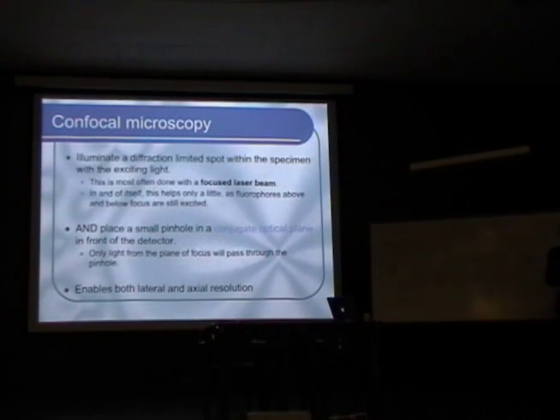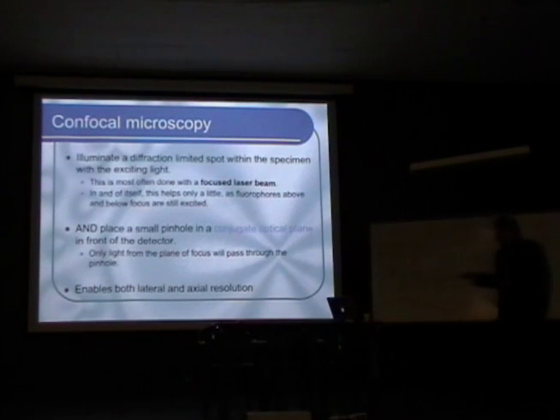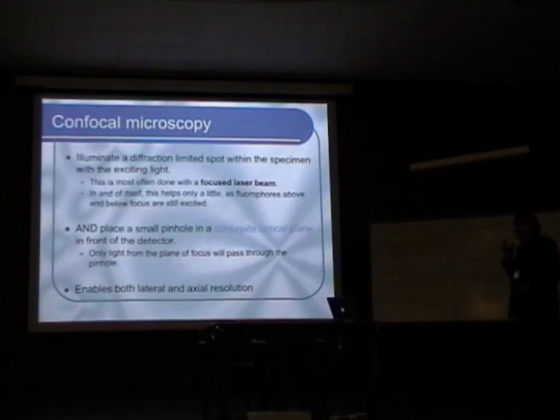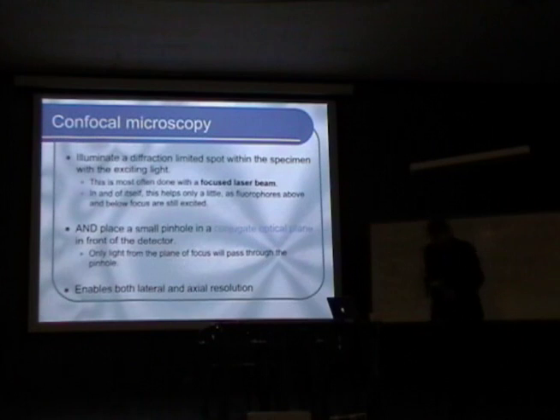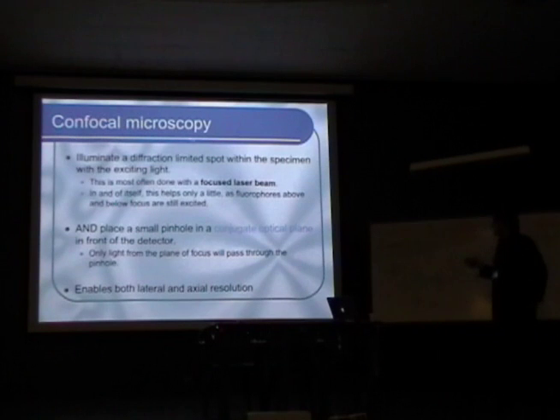So now the techniques we have discussed so far provide only two-dimensional optical resolution, right? So in other words, we can resolve features in the sample in the plane orthogonal to the optical axis of the microscope. However, those techniques have very poor ability of resolving features along the optical axis of the microscope. The first technique which enabled this possibility was confocal microscopy.